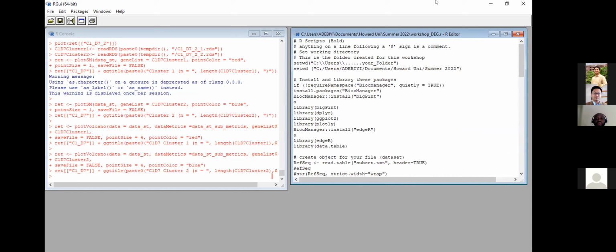If anybody has any questions, oh yes, people do have questions. So for Ms. Rashid, right? Okay, Rashid, and let's see, and Kwesi, right? I'm not sure. Houston. So you said you ran into errors when you're doing this first step. I guess it's how to install and library the bigPint package.